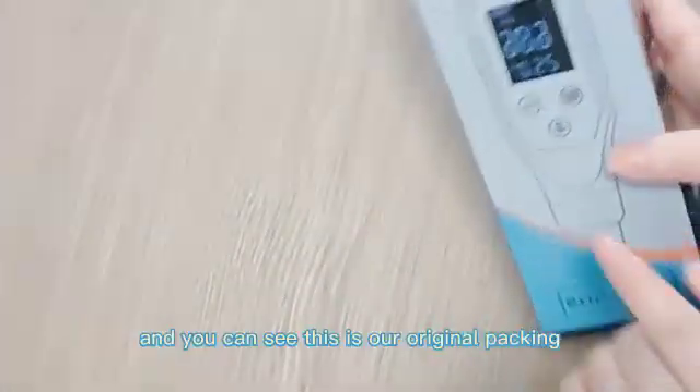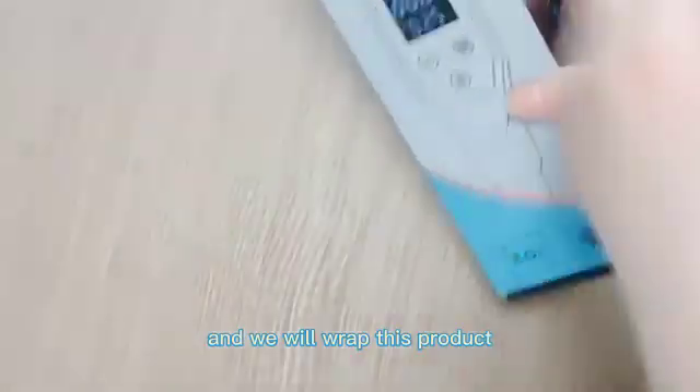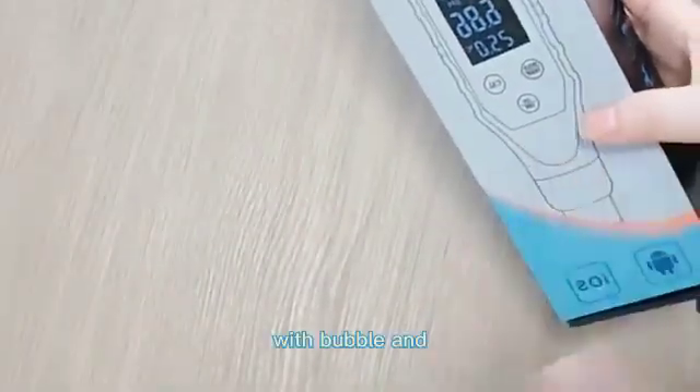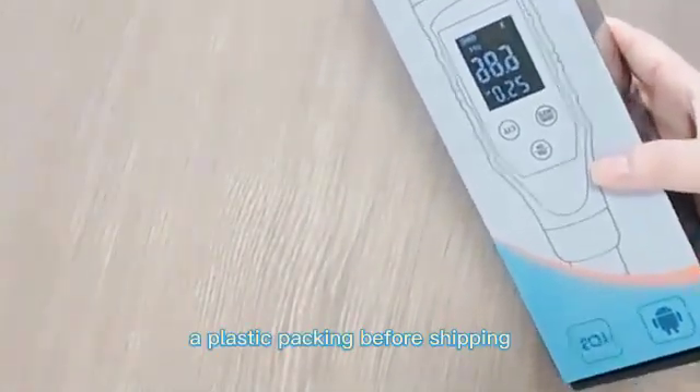You can see this is our original packing, and we will wrap this product with bubble wrap and plastic packing before shipping.